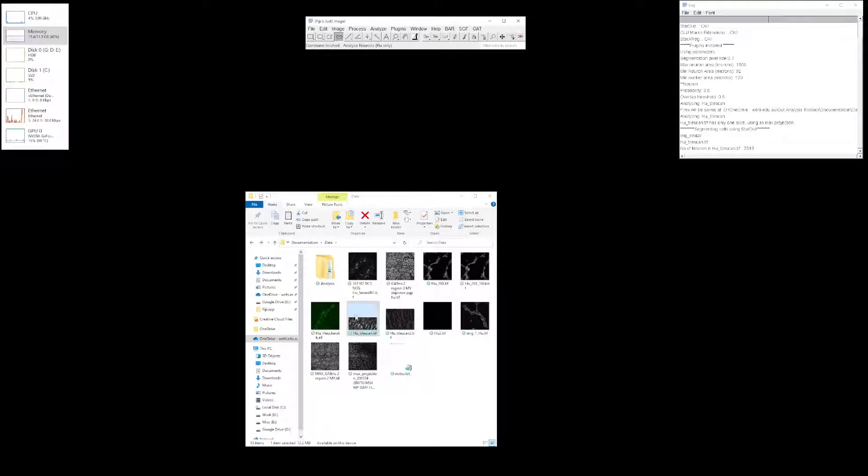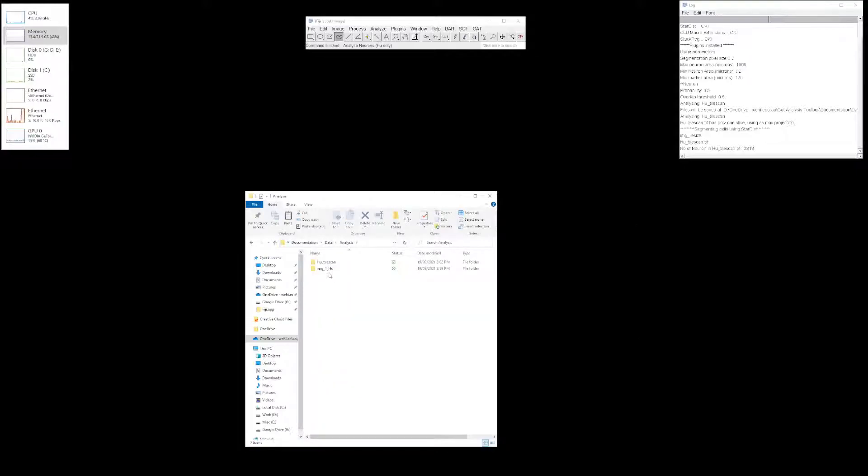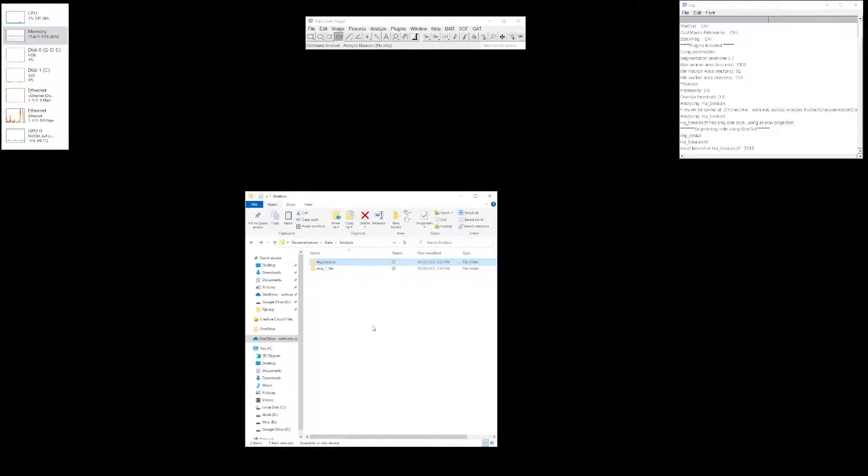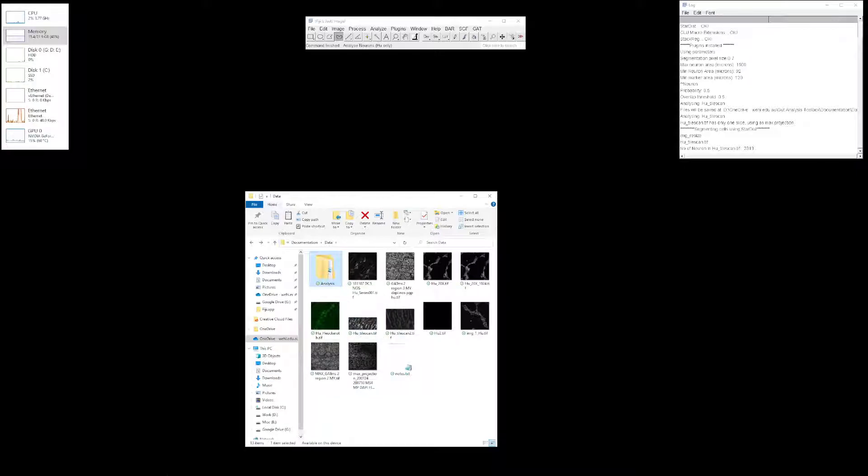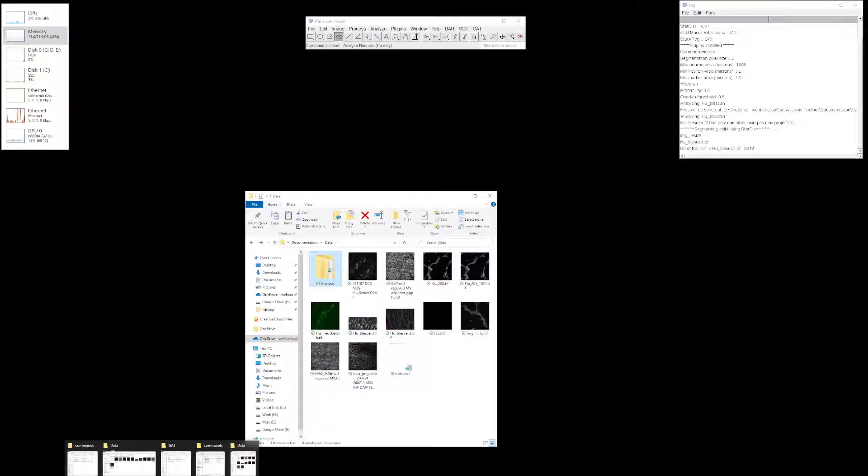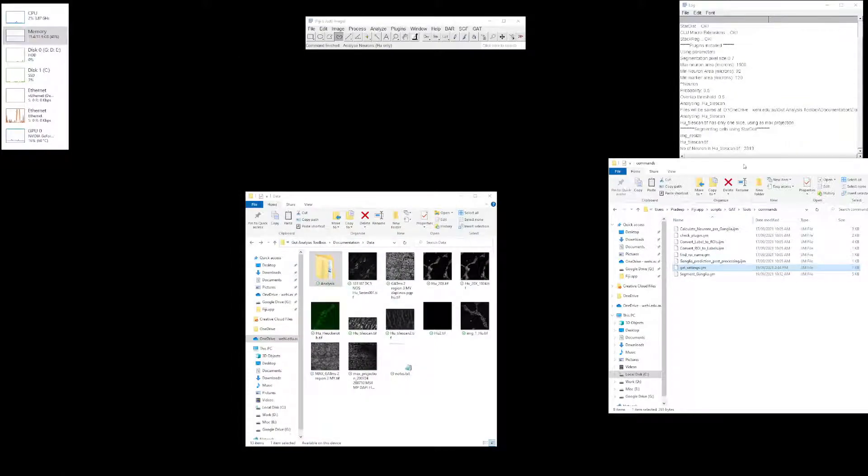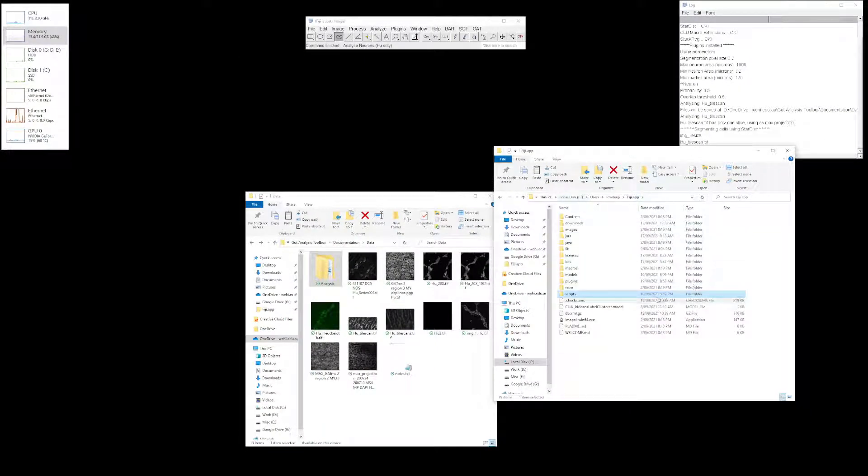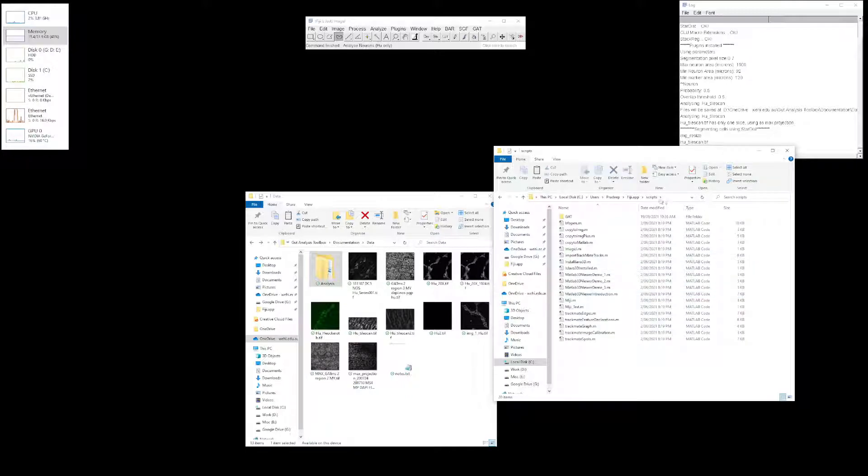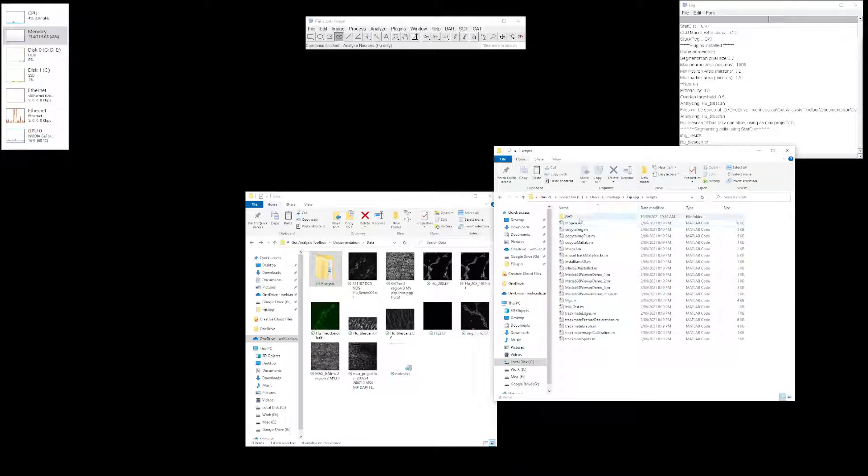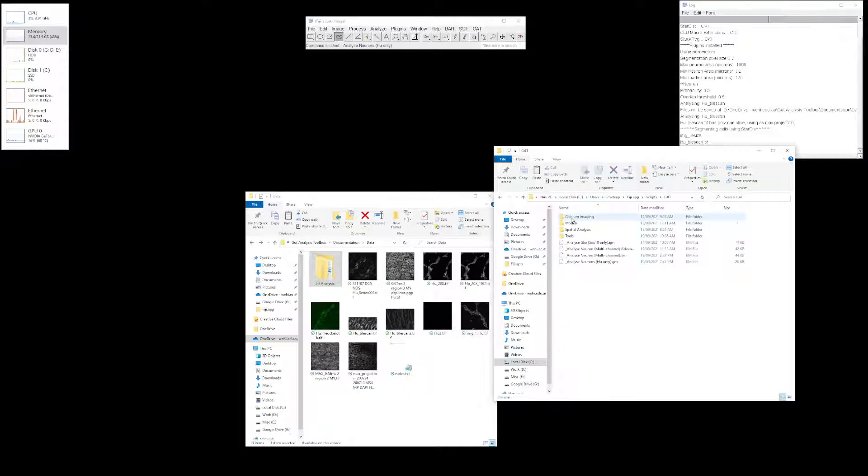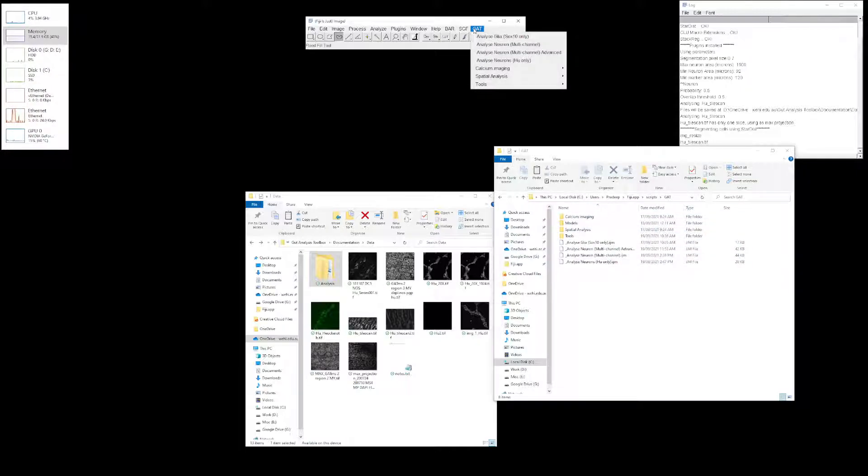You can see it has created a folder called tile scan and all files are there. Now, if you want to fine-tune your analysis, I will show you the folder. This is our Fiji folder over here. GATT, or the toolbox, is located in Fiji, Scripts, GATT, and these are all the files. If you look at the menu, it's the same organization.